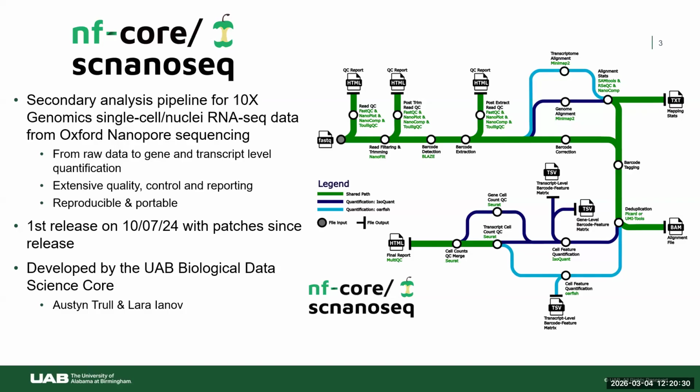And then we deliver the data. The key outputs will be those matrices that you can put into downstream tools such as Seurat or Squidpy, as well as the MultiQC report, which will compile most of this analysis. So that's the overview of the workflow and where it is at the moment. We'll be touching a little bit in a few slides on where we started and where we'll go.